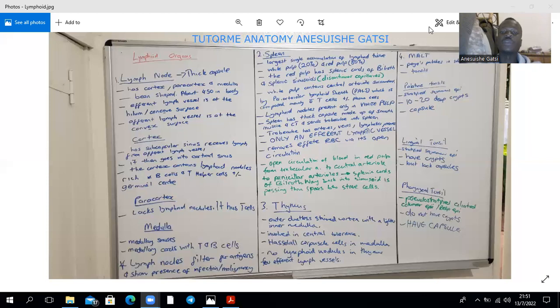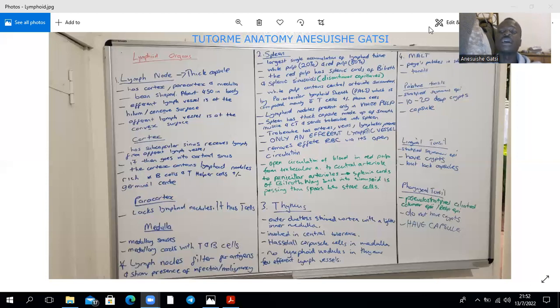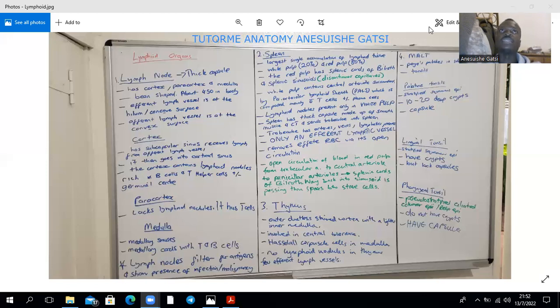The thymus is going to be characterized by a cortex and a medulla. There's an outer darkly stained cortex with a lighter inner medulla, and it's involved in central tolerance. The thymus reaches its maximum size at puberty, after which it starts to involute. It's a bilobed organ found in the superior mediastinum, anterior to the great vessels, with some part extending into the anterior mediastinum where you find it anterior to the heart. Within the cortex, you have positive selection, where you select T cells that are able to bind MHC.